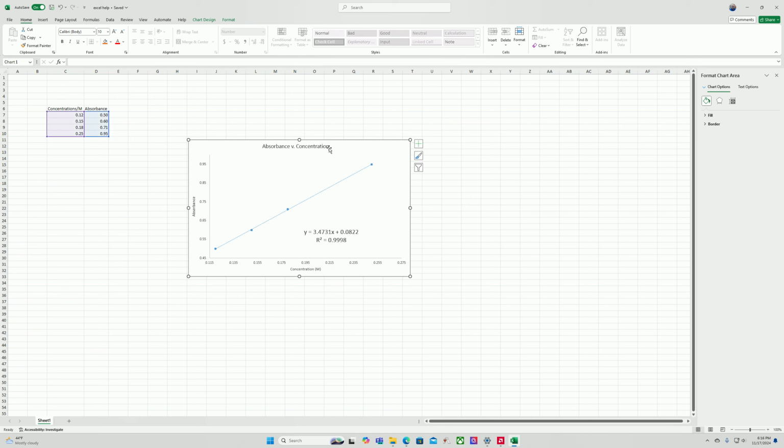Whenever you title your graph, you can think about what you're using the graph for, what the purpose of it is, or what equation you're using to produce what's here. As a succinct take home point, never just reiterate your axis titles as your overall title. For here, this would be a Beer's law analysis for molar absorptivity.